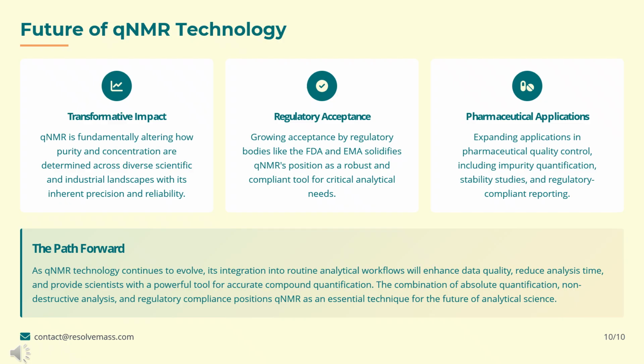Finally, let's talk about the future. qNMR is transforming how scientists determine purity and concentration. Regulatory bodies like FDA and EMA increasingly recognize its value. Its applications in pharmaceuticals continue to expand: impurity quantification, stability studies, and regulatory compliant reporting.